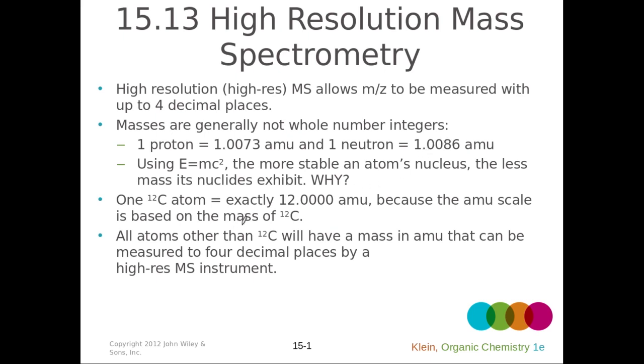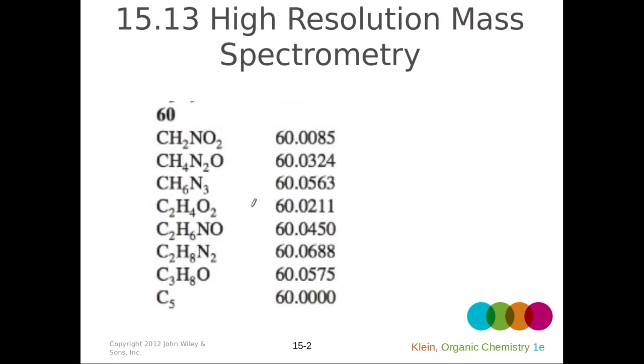We can see that a carbon-12 atom weighs exactly 12 AMUs because that's by definition. But all the other atoms have slightly different atomic weights.